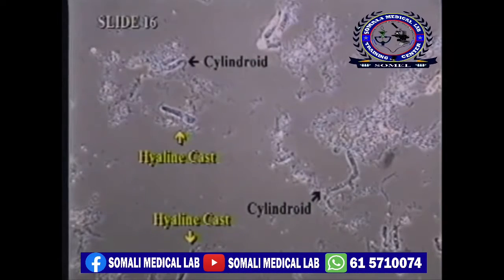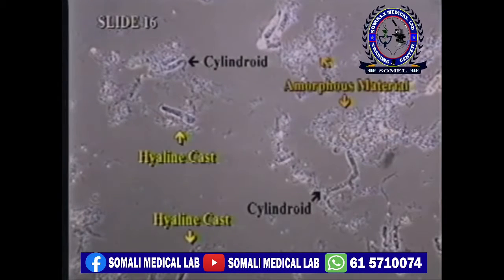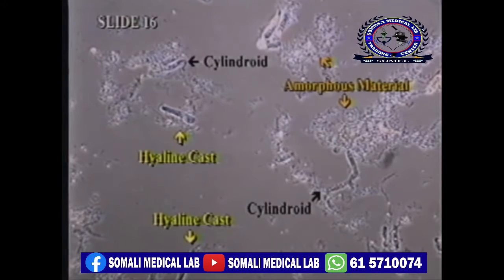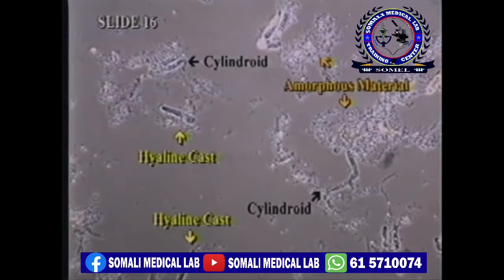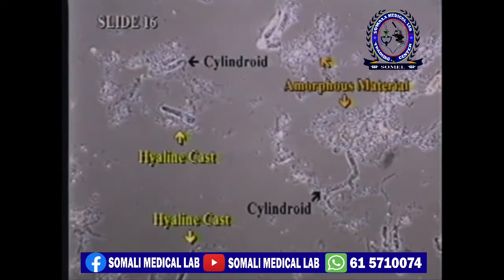In this slide, we see several hyaline casts and cylindroids, along with what we now call amorphous material. This amorphous material is small crystal debris. In the old days, we used to distinguish amorphous urates from amorphous phosphates based on the pH of the urine they were found in. Who cares? It is sufficient to report amorphous material.